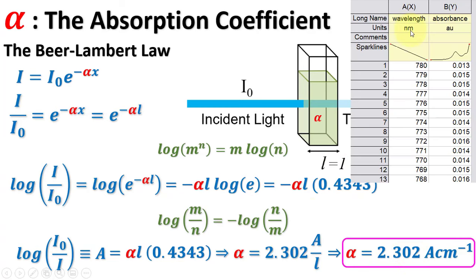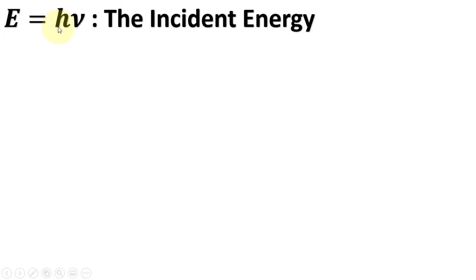Thus, from the UV-Vis absorption data, we will directly put the value of absorbance and alpha will be in the units of cm inverse. Now, here we will convert the incident energy values into some feasible units. As E equals h nu and nu equals c over lambda, putting the values.